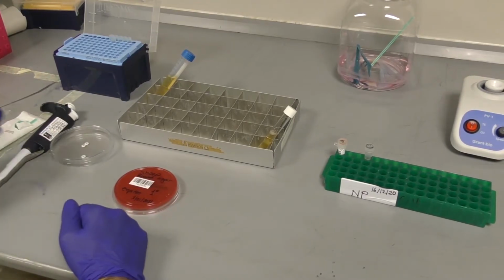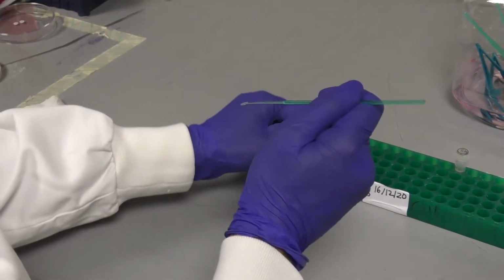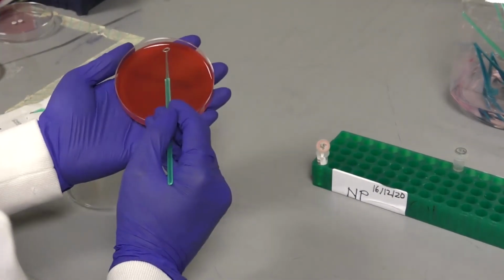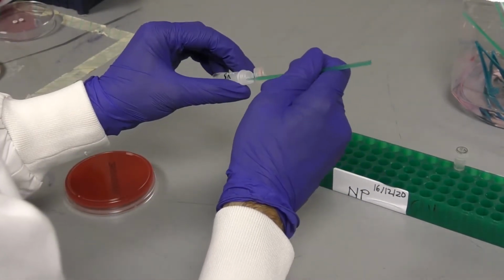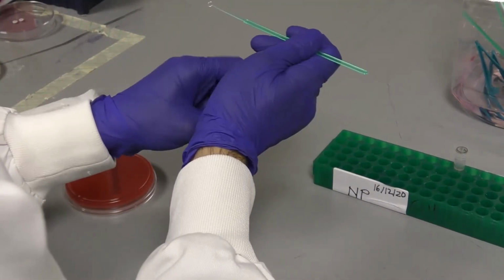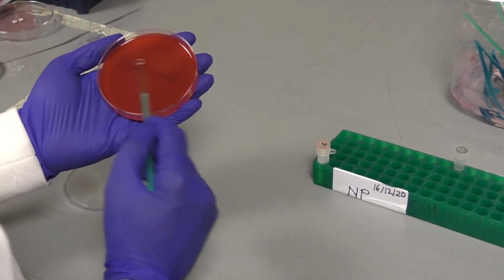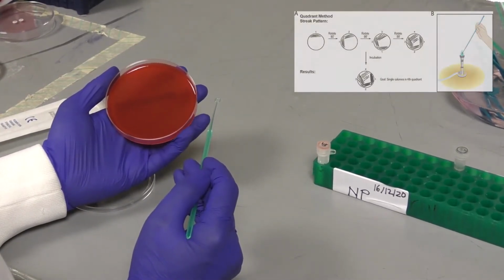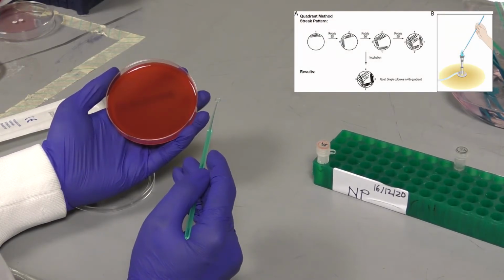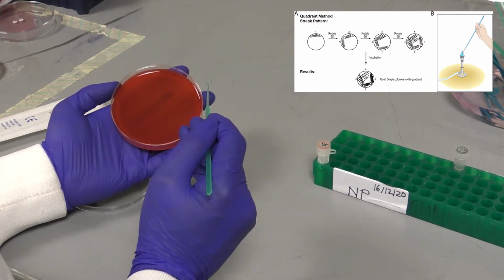Using a 10 microlitre sterile inoculation loop, take 2 full loops, 20 microlitres, of the incubated THY broth and inoculate onto the plate to create a primary inoculum spot. Change loops between each 10 microlitre inoculation or flame if using a metal loop. Then go on and use the quadrant streak method to complete the inoculation process. Once you've inoculated your 20 microlitres, you will rotate the plate 90 degrees and then streak using a flamed loop or a new side of the disposable plastic loop.